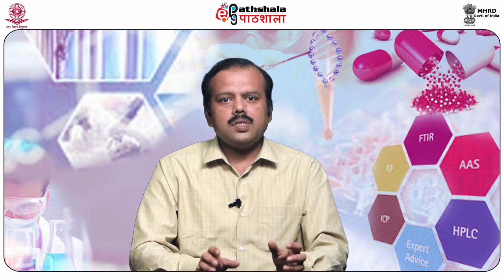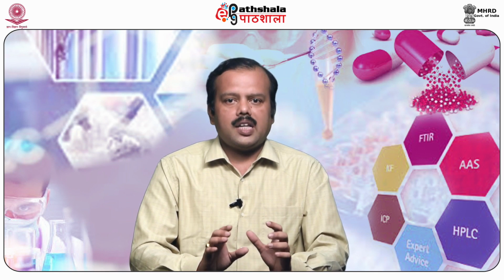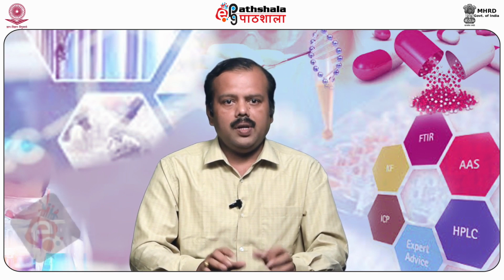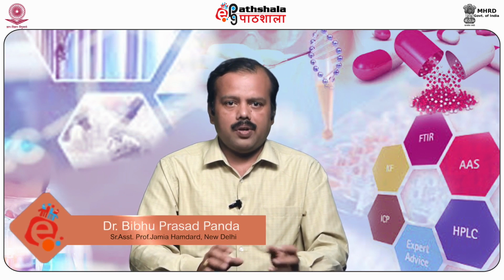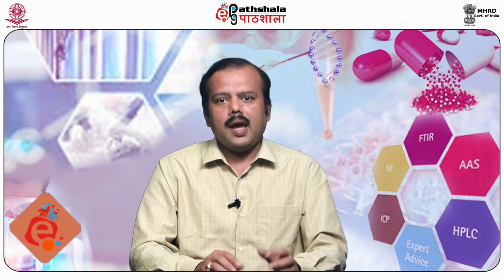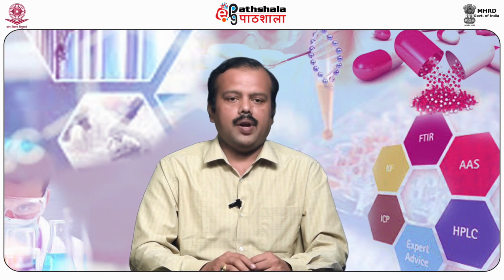The actual inhibition of the observed microbial growth under stringent standardized experimental parameters may be judiciously utilized and adequately exploited for demonstrating as well as establishing the therapeutic efficacy of antibiotics.